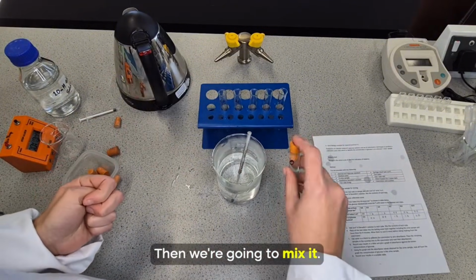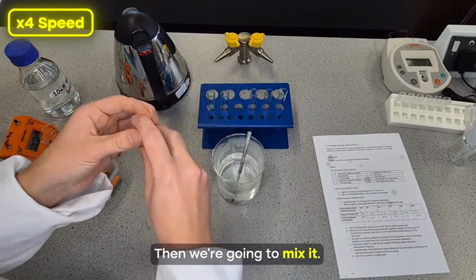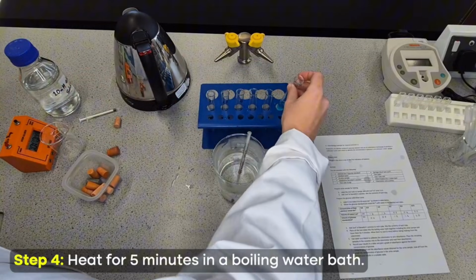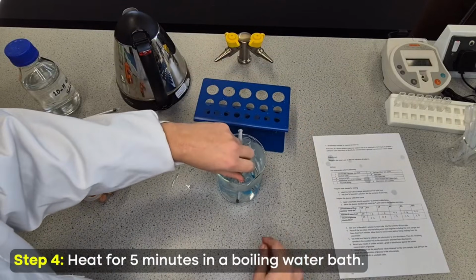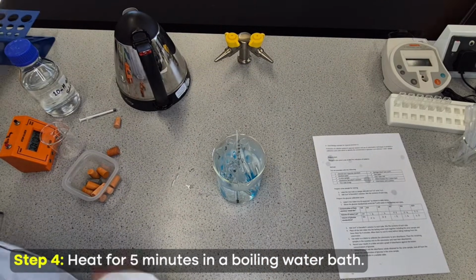Then I'm just going to mix it. And now we're ready to put all of those into our water bath. And it'll take probably about 4 to 5 minutes for the reaction to occur.